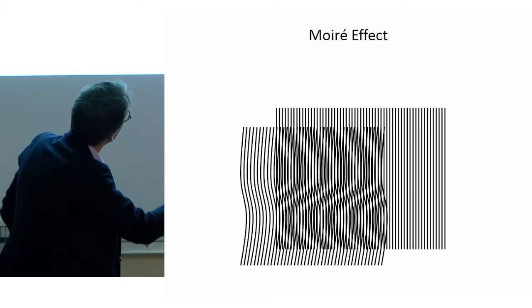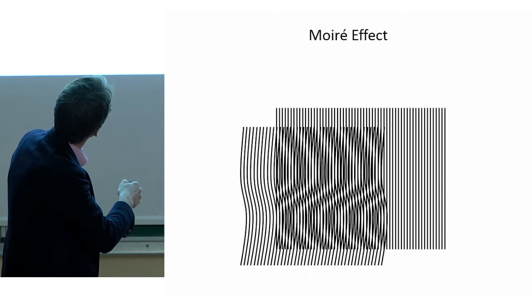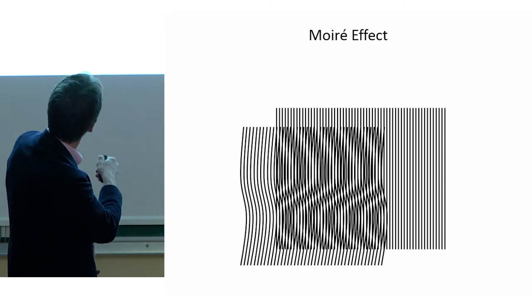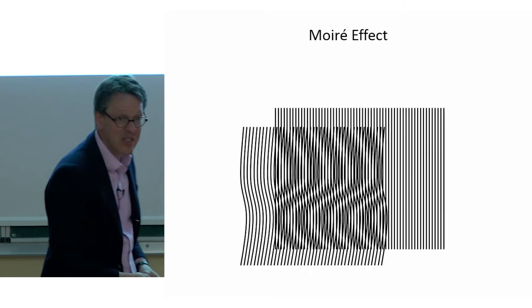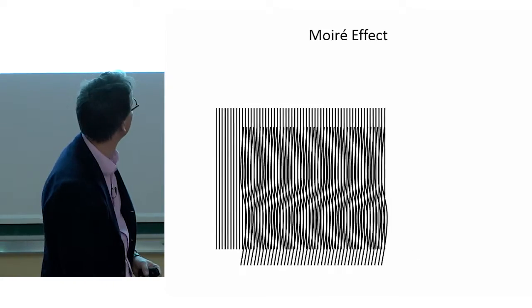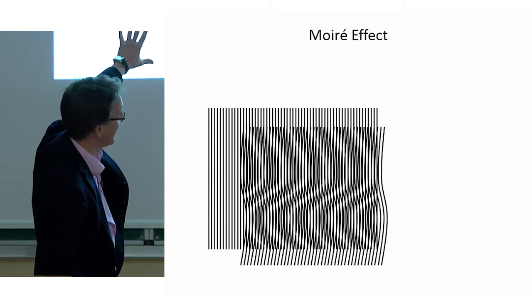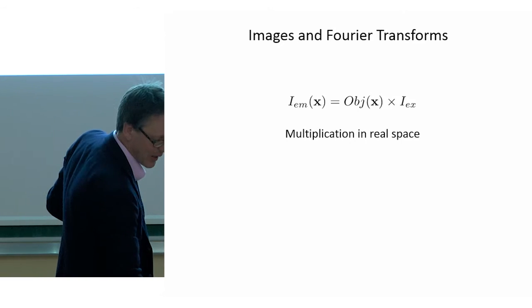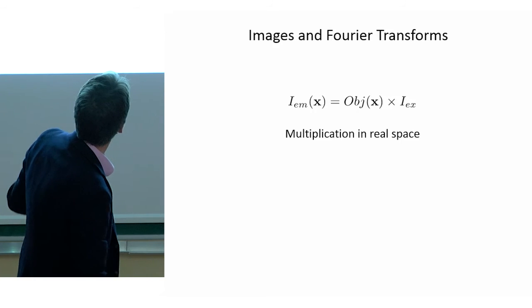And of course, if I know the spatial frequency for my illumination pattern, then it is clear that I should somehow be able to recover from these low frequency beats the original frequencies in my sample. So you have to play some Fourier tricks. It becomes a mathematical problem then rather than an optical problem. And so you move these illumination patterns quickly along to generate lots of images, right? You have to rotate them as well to be able to do this. So here's this. I haven't got really time to do this.